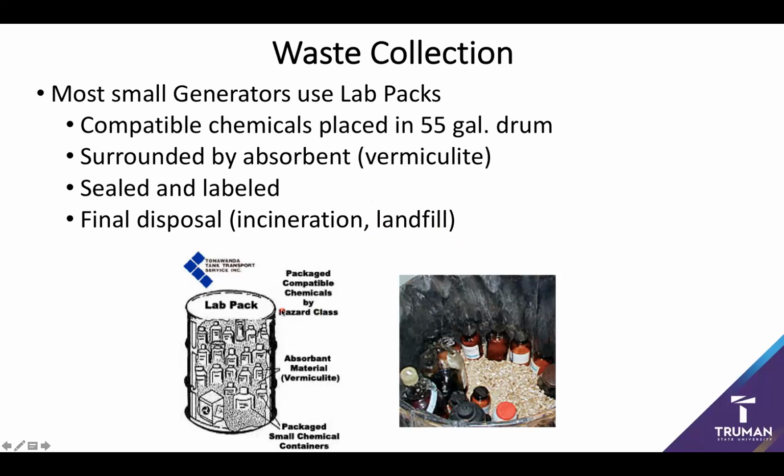So this gives us the major idea of how we should store chemicals and how we dispose of the waste. Next time, we're going to go through essentially a quick rundown of best practices of lab behavior.